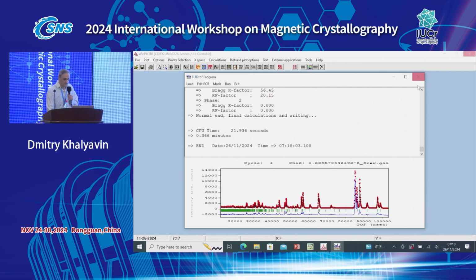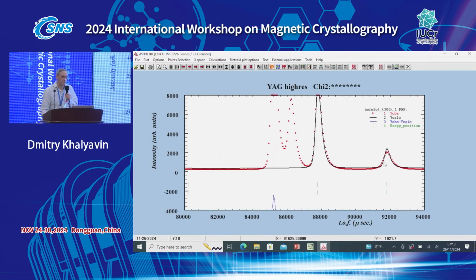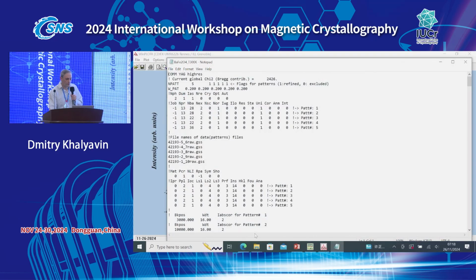Okay? Yeah, it didn't work. We couldn't index. So let's move to another point.